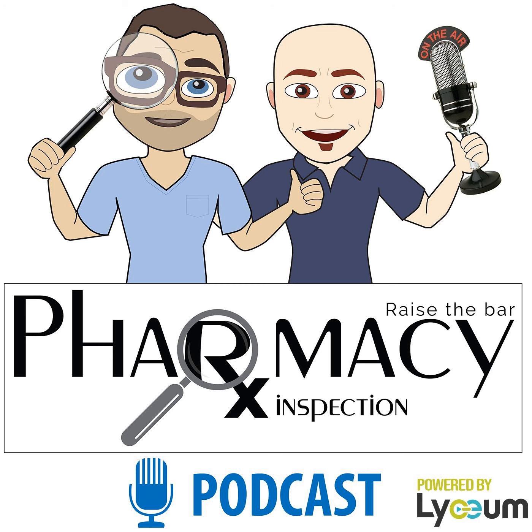So here in the post, I've put in a table for the action levels of viable air sampling. That's found in USP 797, and it basically says that in an ISO class 5 area, if you have greater than 1 CFU in your ISO class 5 area, you need to perform an investigation into what that CFU is, at minimum. So the fact that in April 2019 there were 19 CFU found, an investigation absolutely should have been performed.